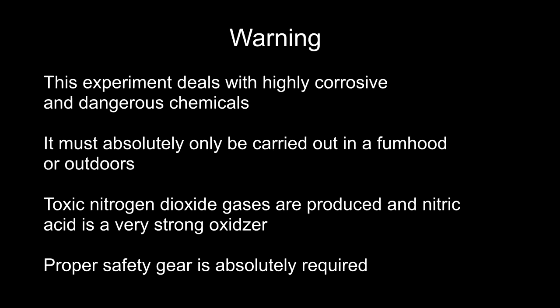Just as a warning, this experiment deals with highly corrosive and dangerous chemicals. This experiment must only be carried out in a fume hood or outdoors because toxic nitrogen dioxide gases are produced, and nitric acid is quite volatile and is a very strong oxidizer. Proper safety gear is absolutely required.